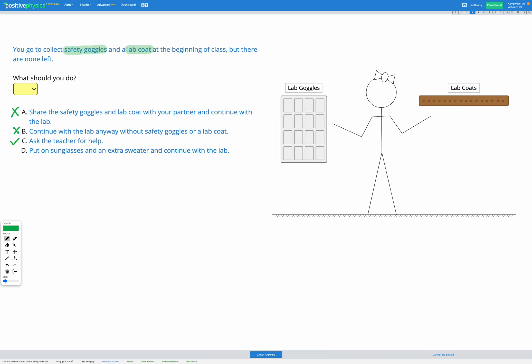The last option is to put on sunglasses and an extra sweater and continue with the lab. This may seem like a good alternative to safety goggles and a lab coat, but actually safety goggles and a lab coat are designed intentionally for chemistry labs. They're made of specific materials designed to resist impact or to resist burning. So putting on any old sunglasses or glasses and any old sweater isn't going to be as useful as if we had safety goggles and a lab coat specifically designed for chemistry. So that's not going to work. So our best option is going to be C in this situation.